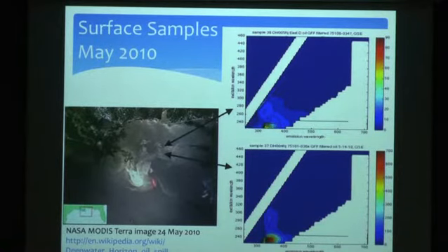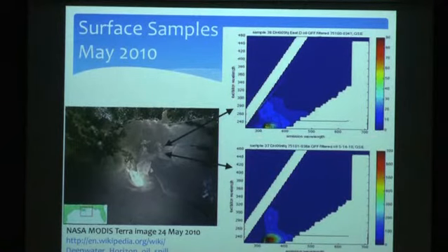So this is, again, that same true color image. And these are our EEMs now from, you know, our fluorescence scans. This is the excitation wavelength. This is the emission wavelength. And what you see is this characteristic, like bullseye kind of spectrum here. It's not, CDOM would be spread out kind of along an axis like here. And this is from oil, and they're very high concentrations. This is like 700 now. The white spots are where we cut out.